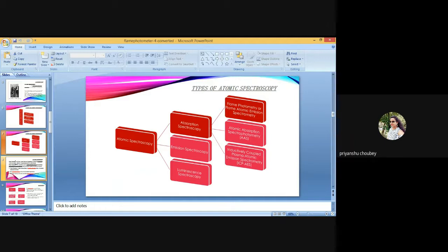Precaution: acetylene cylinders should always be used in a vertical position to prevent liquid acetone entering the gas line.